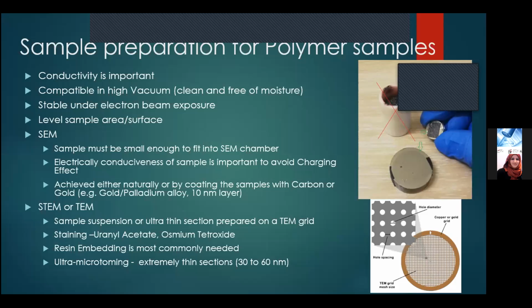It needs to either be prepared in another way that removes the moisture from the sample, using a fixative sample preparation method. It's usually where we would find this for biopolymers or for biomedical or biological samples. That's something that I'll explain just now.